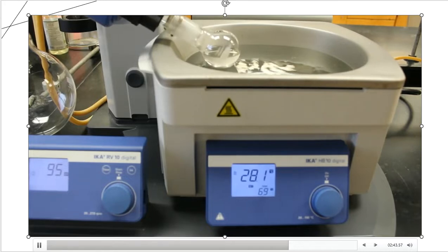In the lab directions, it actually tells me to distill it until I get to 250 degrees and collect everything after 250 degrees. I'm not going to go through that step, and the reason is because it's not quite necessary. I'm just going to assume that if there are impurities present, we're okay with those impurities. I'm not going to take the time of heating a piece of glassware super hot above 250 degrees and collect that product. If I have product, that product will be in this flask after my methylene chloride goes away. And if it has impurities, then so be it. But the majority of my product will be there, and the majority of my product will be pure, I hope. Keep the fingers crossed.